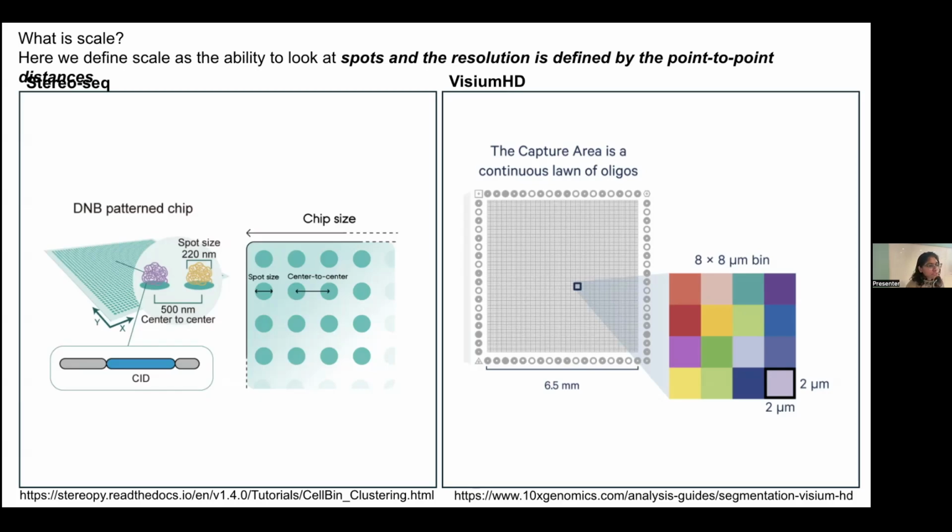In principle, when it's random sampling of a tissue area, does it matter if there's dead space? If the tissue area is large enough, you're going to capture enough spots from enough regions, and you're going to be able to profile the sample features or the region features, unless the region that you're trying to discover is really small.